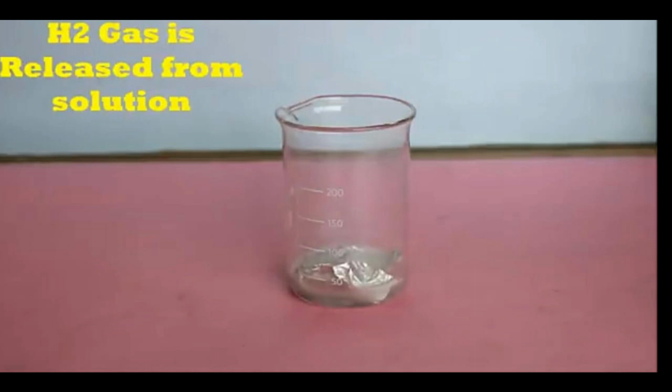We call it sodium aluminate, and it releases hydrogen gas. You can identify the gas as hydrogen when you bring a burning splinter near the water beaker in which the reaction is taking place. It burns with a pop sound. Pop sound means you can just imagine how crackers burn. With that sound, it starts to pop.